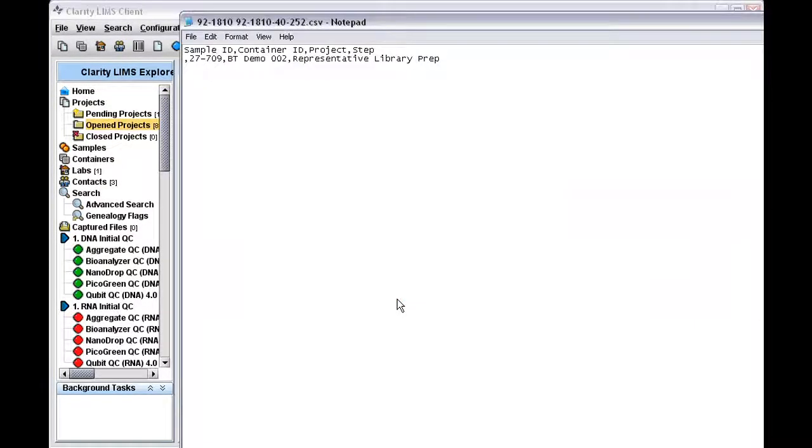Since this is just for a plate, we probably don't want the sample ID, so that column is left blank. We've just got a single line per plate here, so this is the same as before. The only difference is, rather than having one line per sample, because we had multiple tubes, now we're just down to a single line, which makes sense in the plate world. I kept the sample ID column in here, even though it's going to have no use, just so that on the BarTender side, you would just need a single template and set of rules to process this rather than different ones.